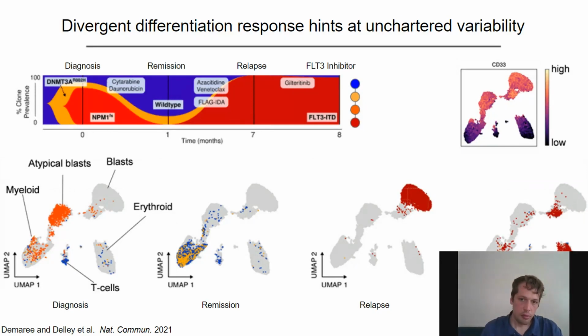So this is really interesting for me to see, that there is this discrepancy, especially in the first time point, between the genotype and the phenotype. And it really highlights that tools like these are necessary in order to have any chance to disentangle these complex relationships between genotype and phenotype. Now, of course, these are just one or two patients, so that's only suggestive and not a statistic.